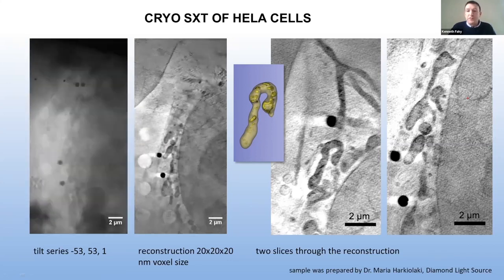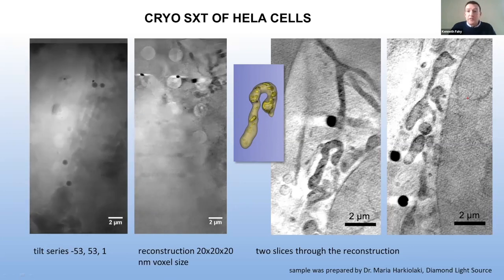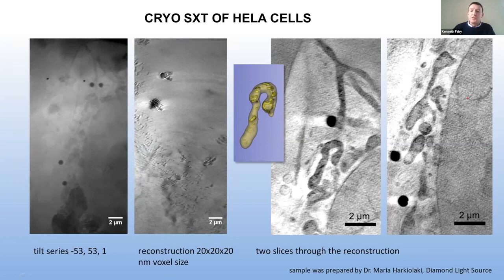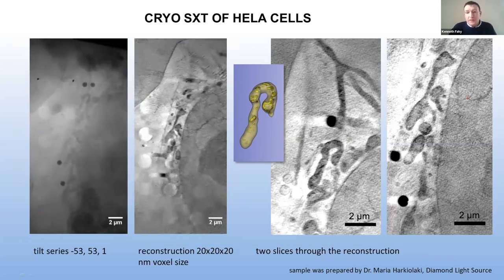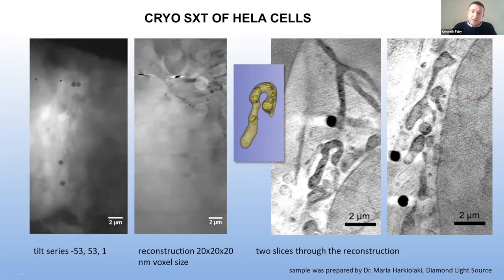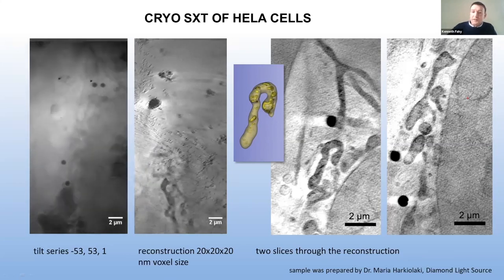And so we can observe cristae of the mitochondria, and this has allowed us to make a rough segmentation of the mitochondria. Although these use cases have shown only mammalian cells, we can also image bacteria and yeast cells too. So we're open and very interested in ideas you may have in terms of more applications of the technique.